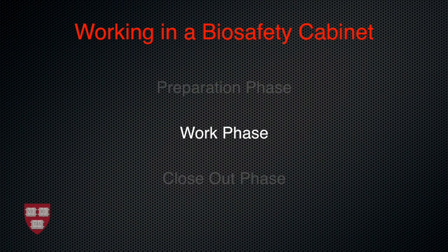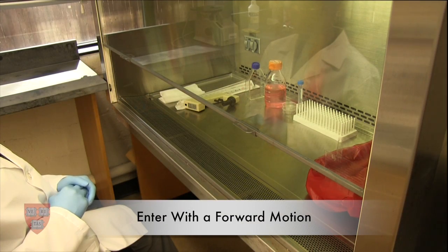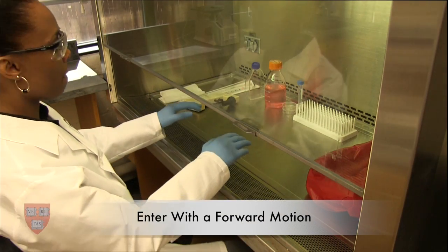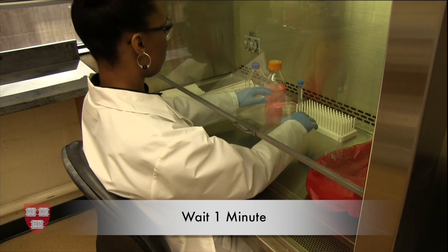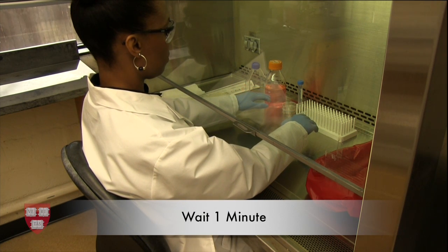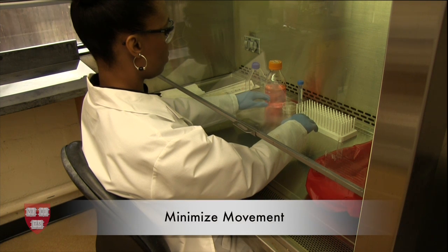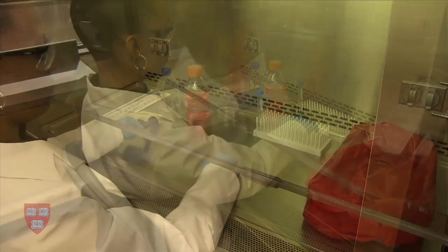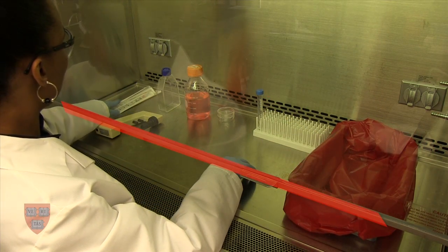Once the BSC is prepared, it's now time to work inside the cabinet. Enter the BSC with a forward motion, avoiding any side-to-side sweeping motions. Wait approximately 1 minute to allow the cabinet to stabilize before starting work. It is important to minimize movement in and out of the BSC to maintain the protective barrier of the cabinet. Always keep the front sash in the lower position when working.